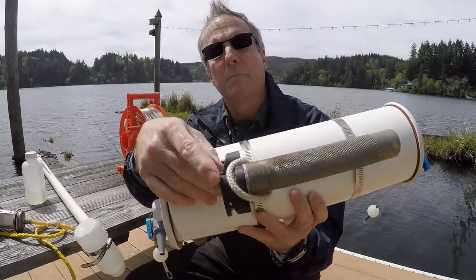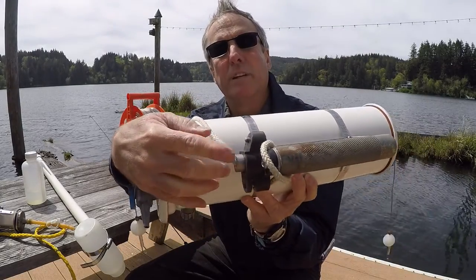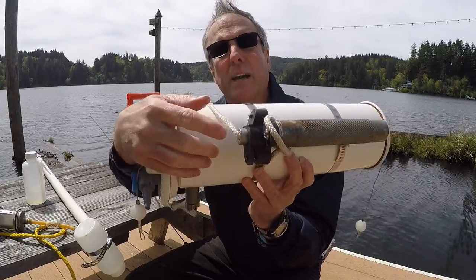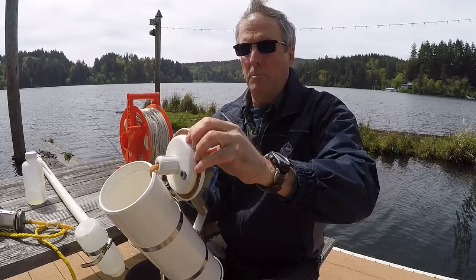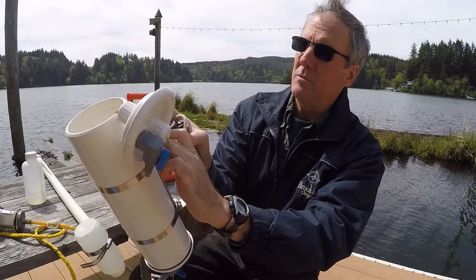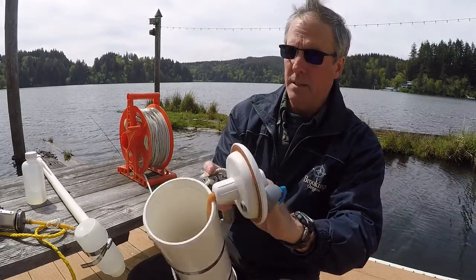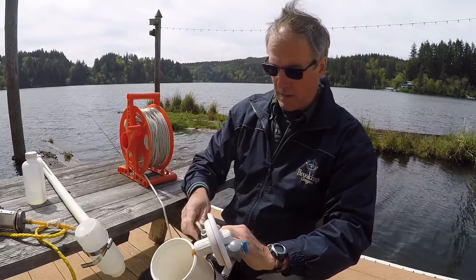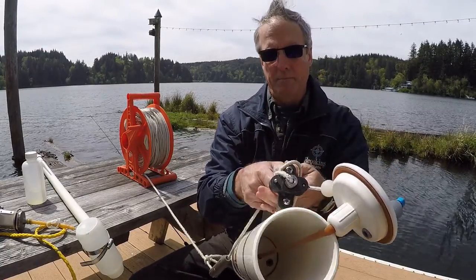Okay, and the same thing with this pin on the outside. That one is now moving, and see it moving back and forth. So I use my finger to push that down. Reopen the bottle here, and I'm going to push that down so the pin is gone, and then allow the pin to come back up, and that traps the lid open. So now the lid can't close because it's trapped in there.